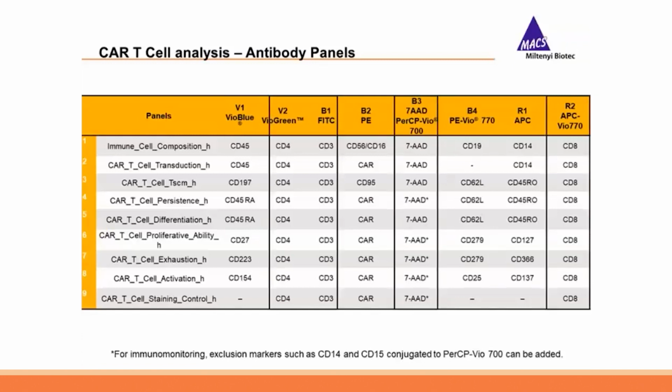Besides the critical evaluation of what markers and what clones to include in the panels, there were some additional considerations in the design of the panels. For example, multiple 8-color panels were defined in order to have higher flexibility and fewer issues that can come with high-parameter panels, for example, due to compensation.